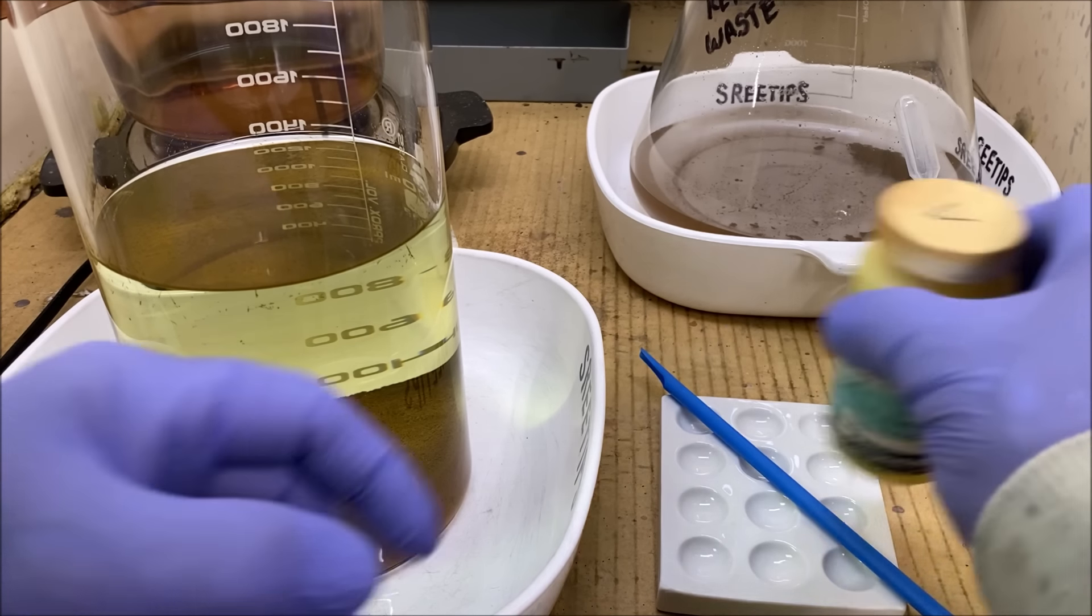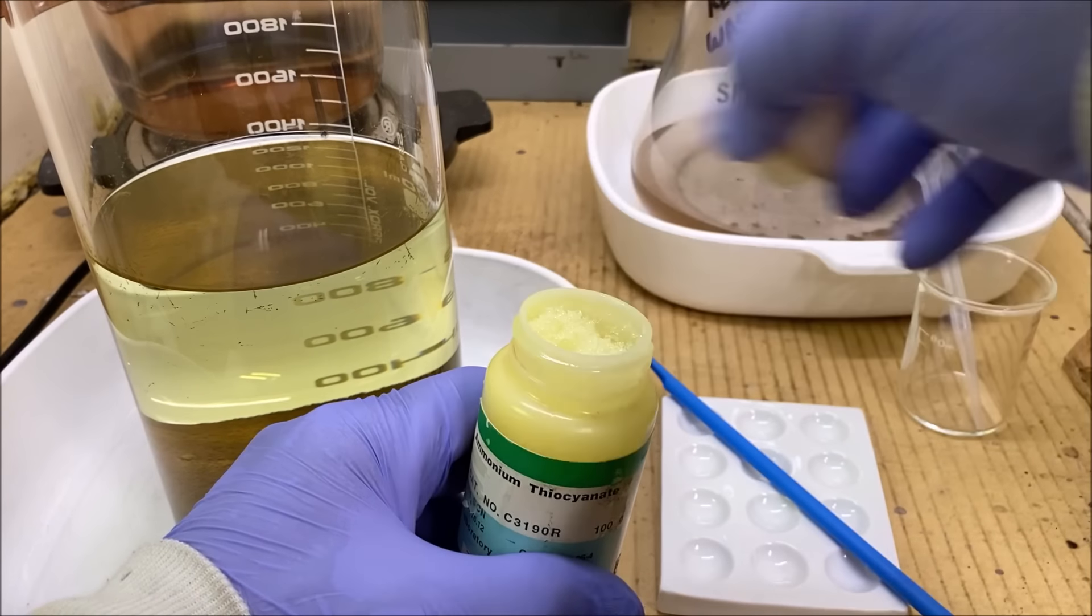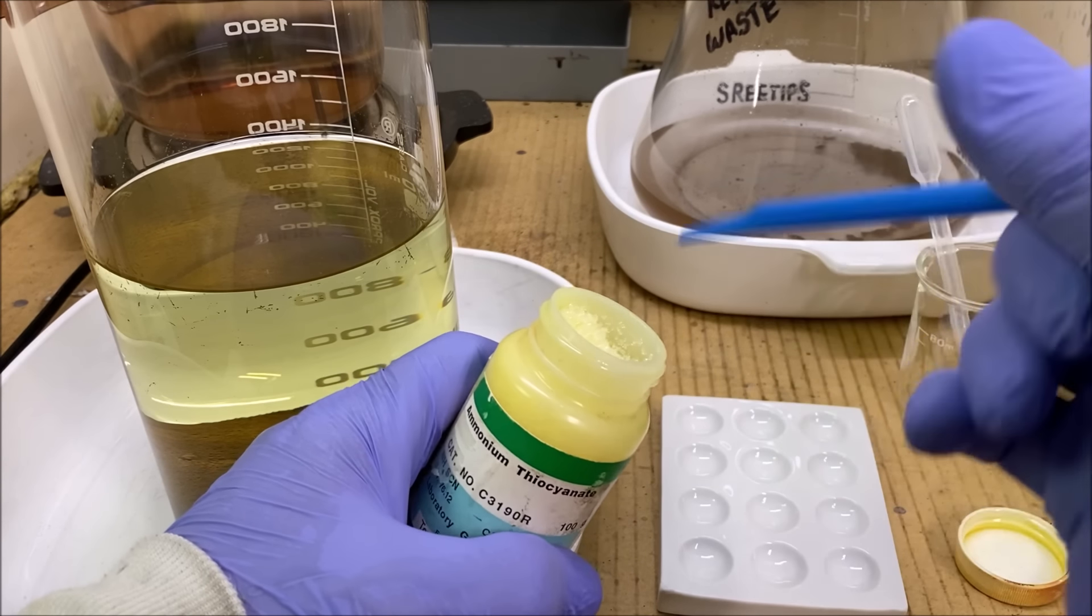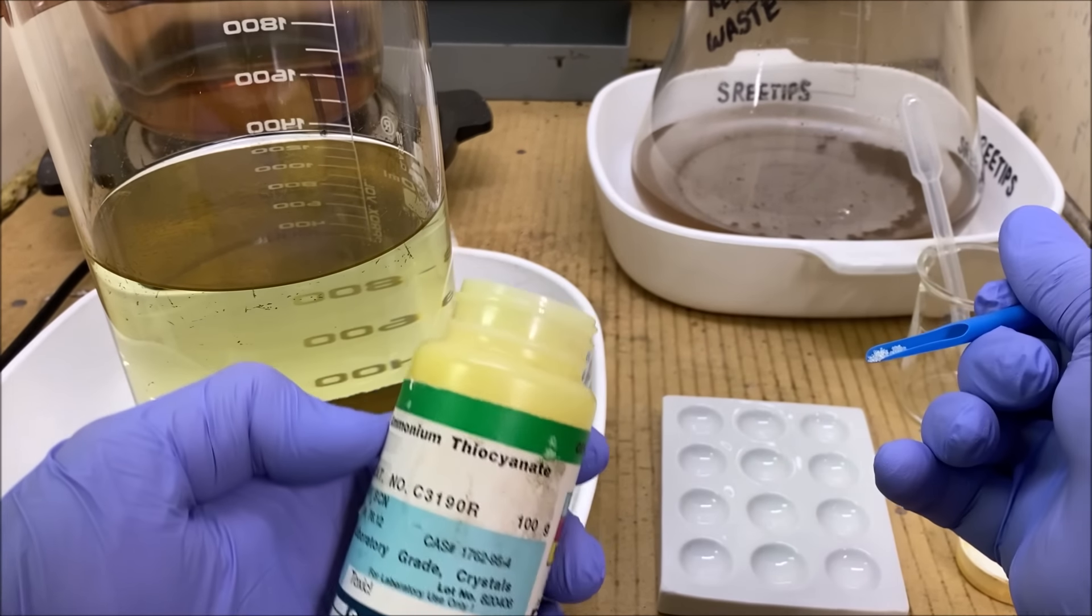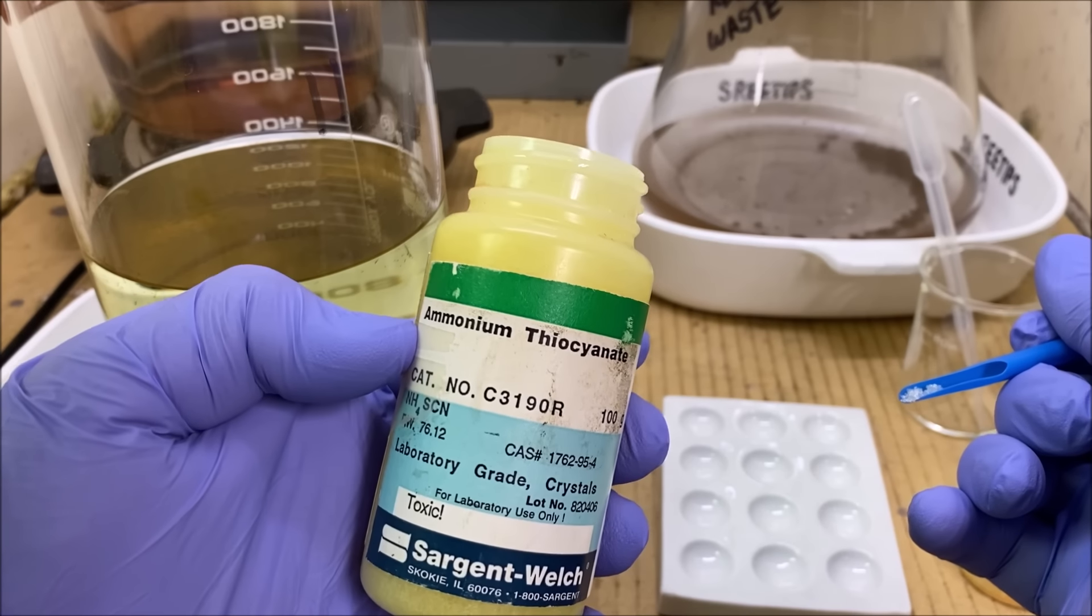Welcome back to part two of the six troy ounce gold refining. What I've got here is some ammonium thiocyanate.